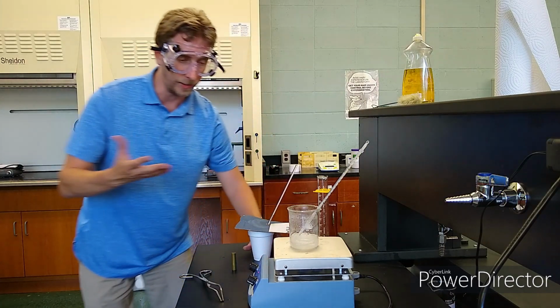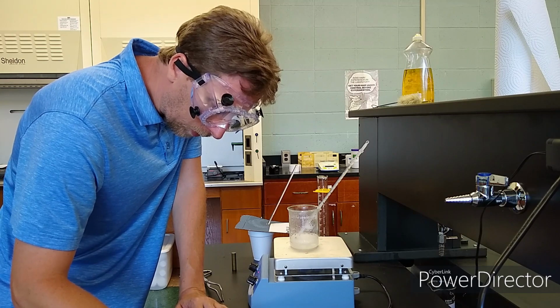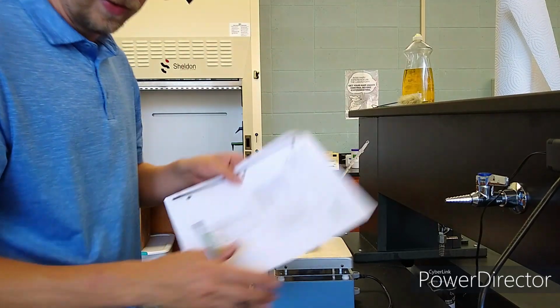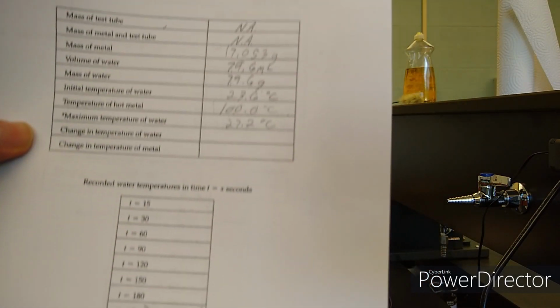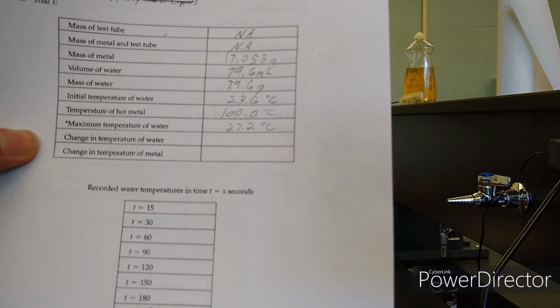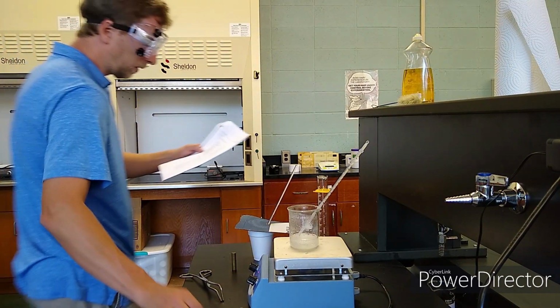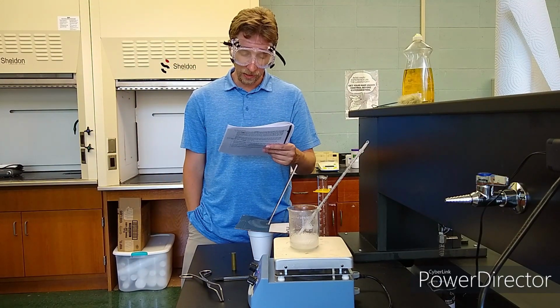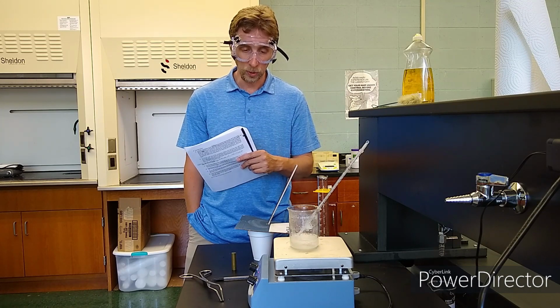Okay, that's what I'm writing down. 27.2 degrees Celsius. That's the maximum temperature that the water went up to, 27.2 degrees Celsius. Okay, well, that is all the experimental data that we need for this lab, for this one trial.